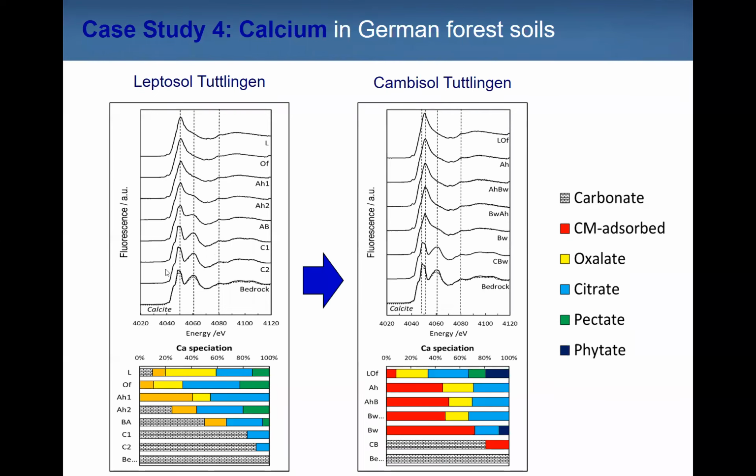And when the soil develops, the calcium dissolution front moves more downward, and the accumulation of clay minerals also moves more downward, which means that the entire feature moves downward. So only here in this cambisol, from cambiare, or cambio, the Latin word for change, the soil has changed from a calcareous soil to a ripe, mature soil.